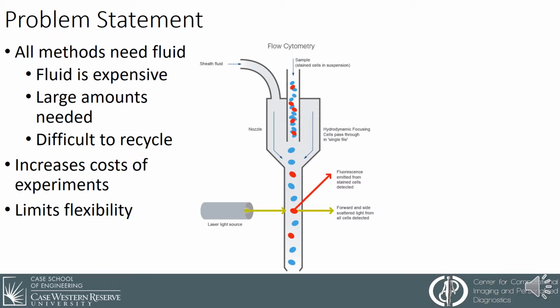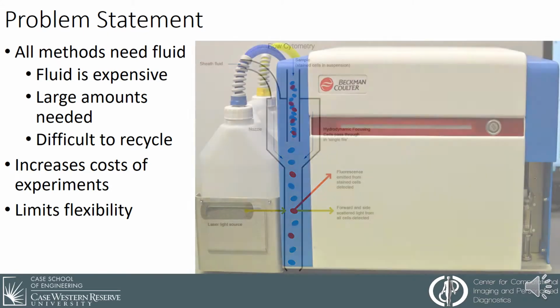This, in turn, limits the availability of this technique to larger, more well-established labs, and also limits the use of this technique outside of a clean laboratory setting, as you need to ensure that the sheathing fluid is constantly flowing and constant maintenance is performed on the pumps to ensure that the machine doesn't get damaged. All of this increases the cost of experiments and limits the technology to only a lab setting and does not allow for practical field use.